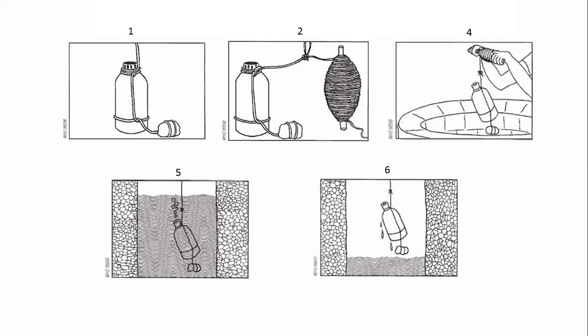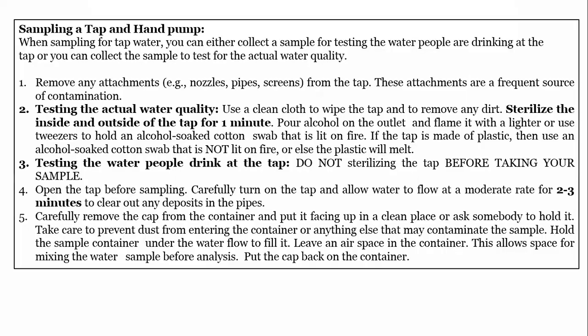So this is simply the procedure to do that for well water in your community, and make sure that you take proper care. You might use a clean substance as a weight, rather than using a stone. If you use a stone, you're going to add sand particles or some other bacteria around. So you might use a weight taken from the laboratory, a special weight, and we tie this rope on the container and we send it.